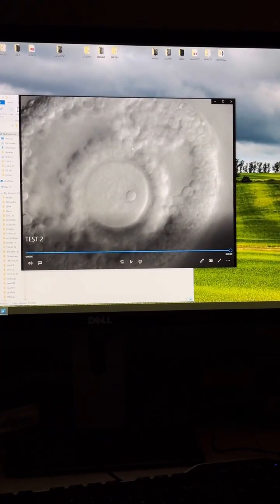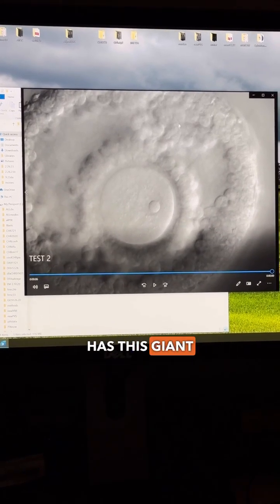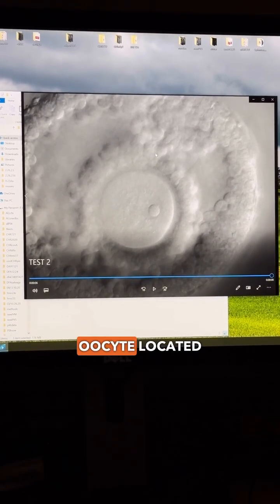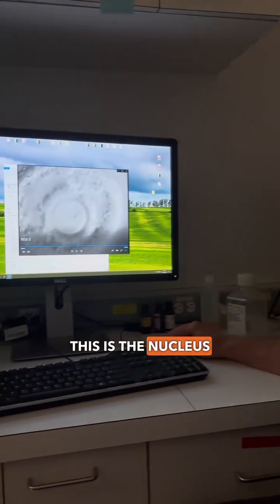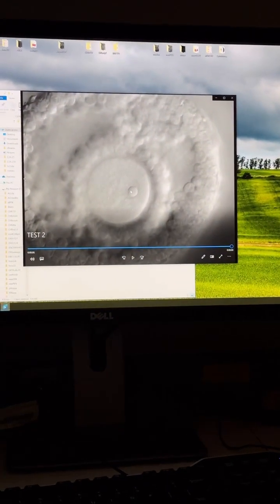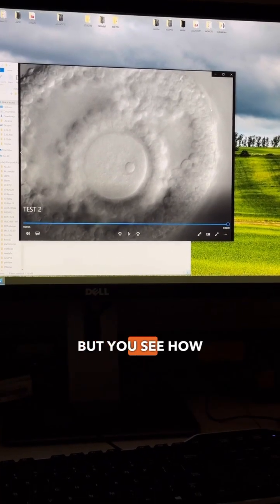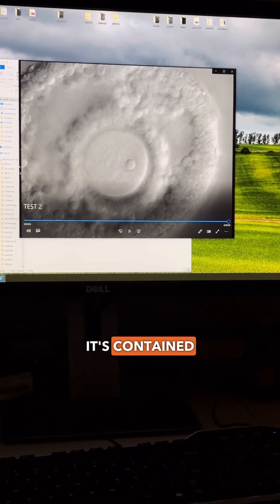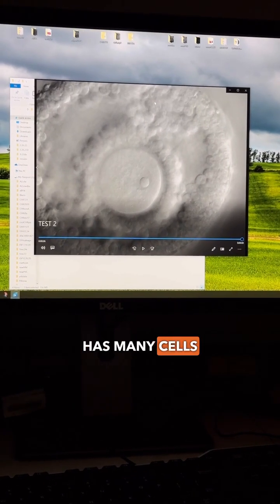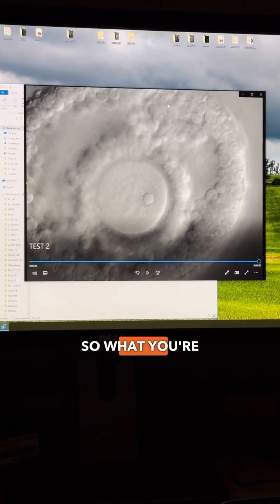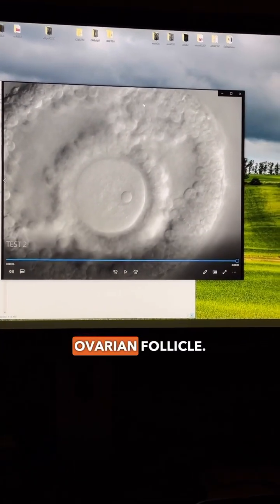The field that we're looking at now has this giant round cell, or oocyte, located in the middle. This is the nucleus of the oocyte — sphere within sphere within sphere — contained in this larger structure which itself has many cells in it. What you're actually looking at is called an ovarian follicle.